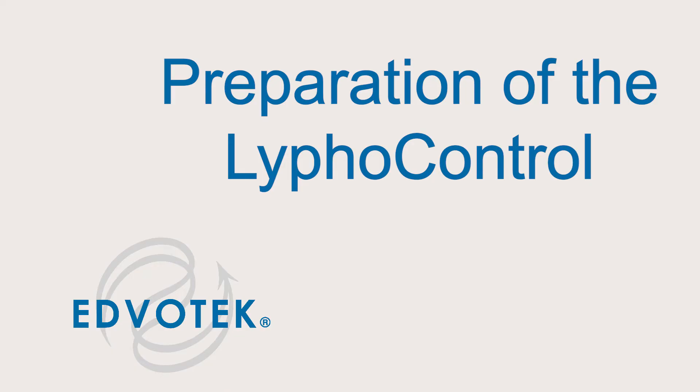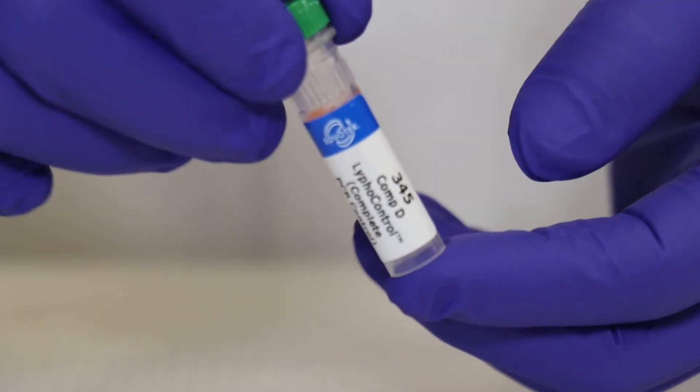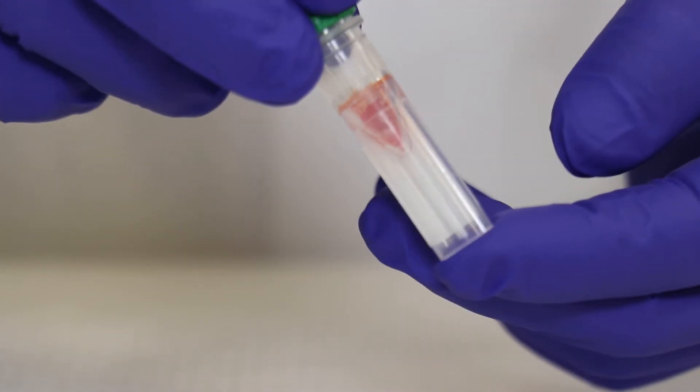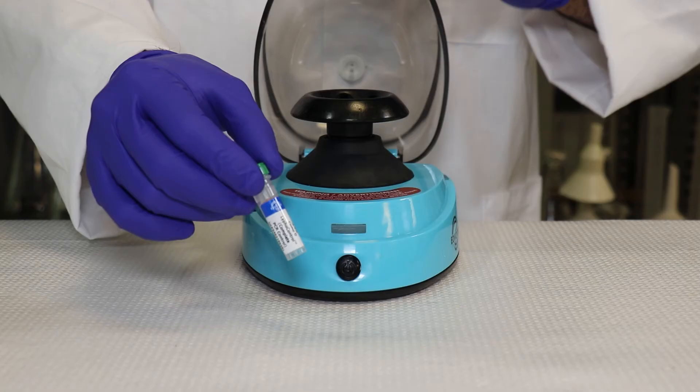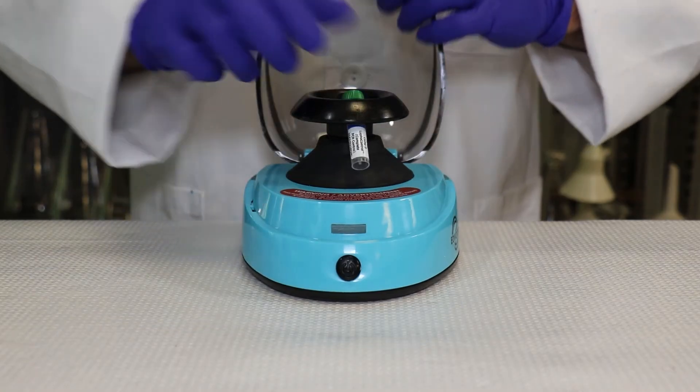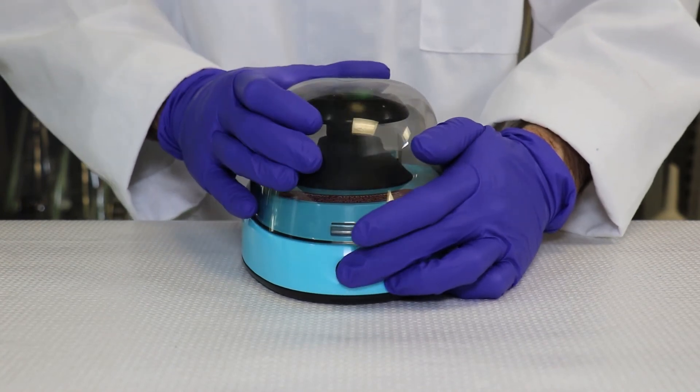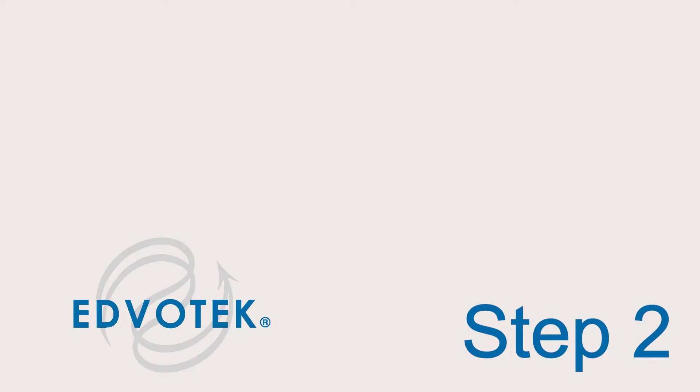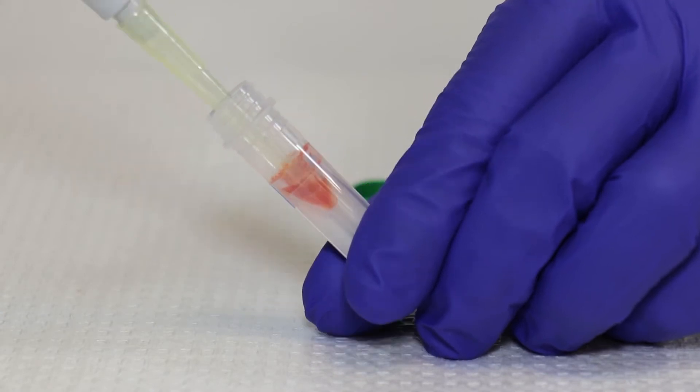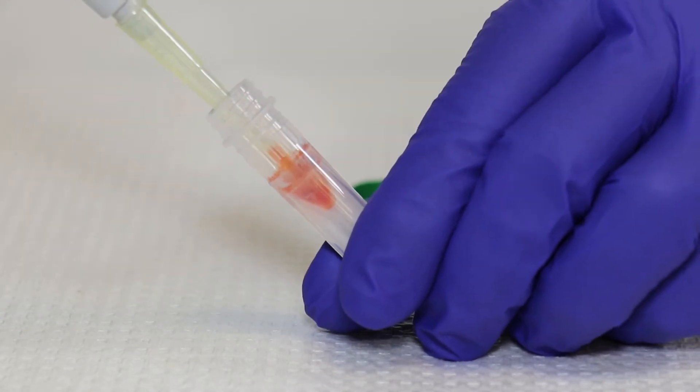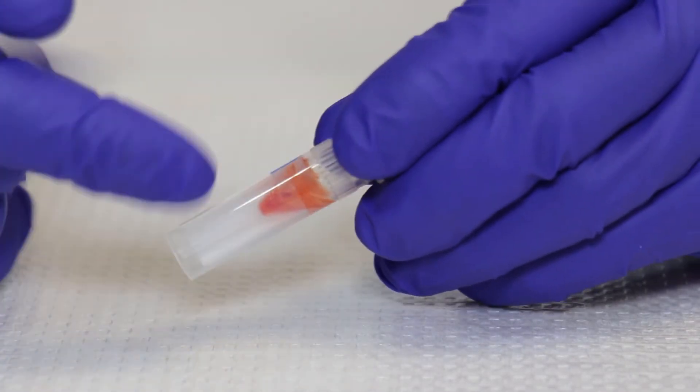Preparation of the lyophilized control: Step 1: ensure that the lyophilized solid is at the bottom of Component D lyophilized control tube. If not, centrifuge the tube at full speed for 10 seconds. Step 2: add 320 microliters of TE buffer to the lyophilized control tube and mix well, then place the tube on ice.